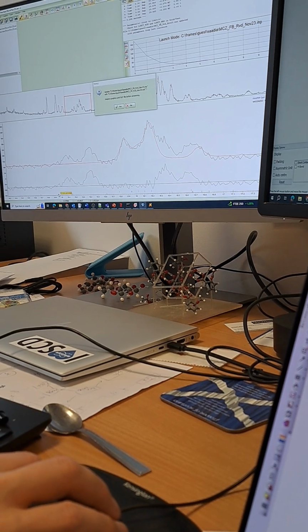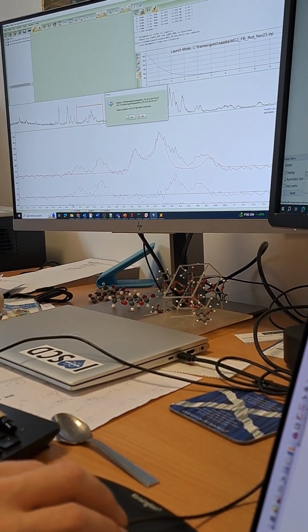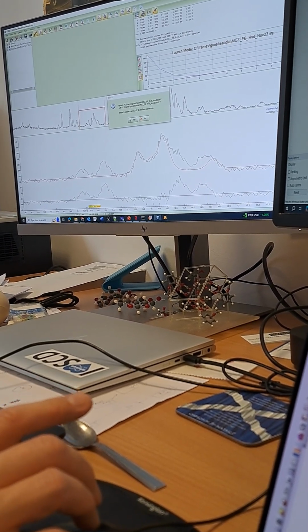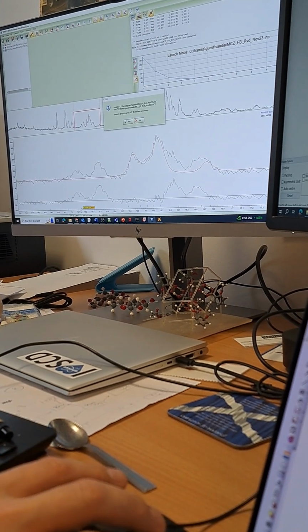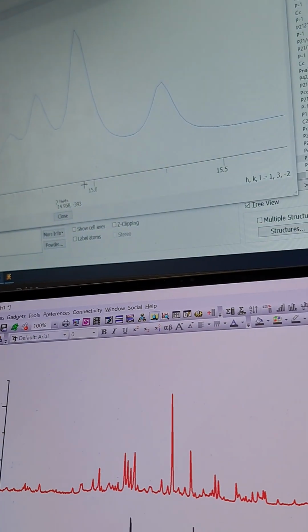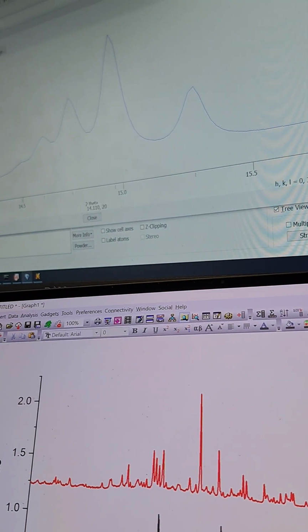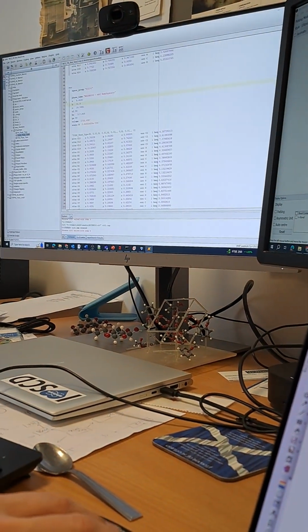So if we start, we think that C is okay. A is the one that we really need to worry about, I think. If we play around with A, this isn't going to move. 0, 5, 1 is not going to move particularly. It might with the beta angle, but the 1, 3, minus 2, which is the big one here, has a component of A, so that will move up. This will move up. Okay, so let's click on there, and we're going to tweak this.